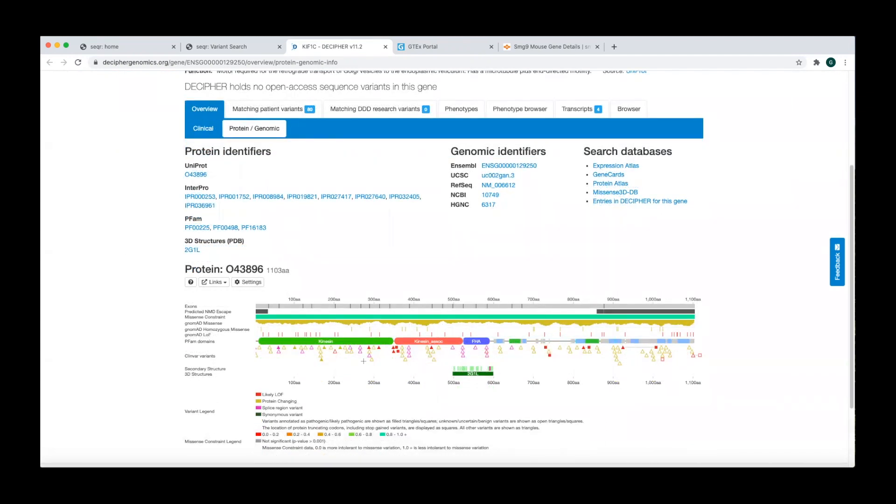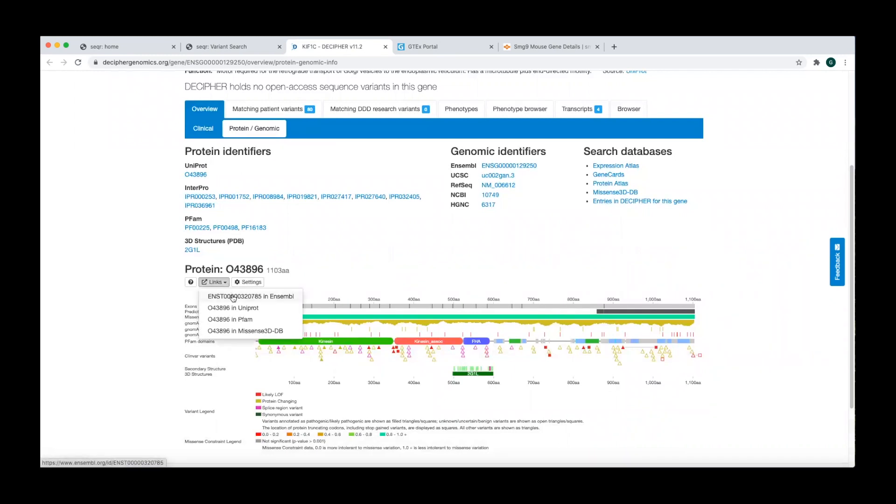It's important to double check that the transcript shown in Decipher matches the transcript you are looking at in Seqr.